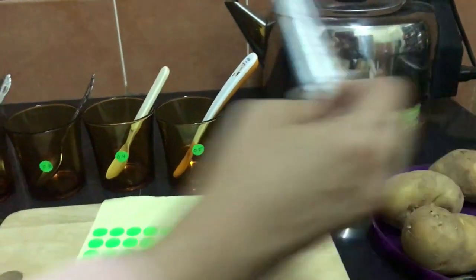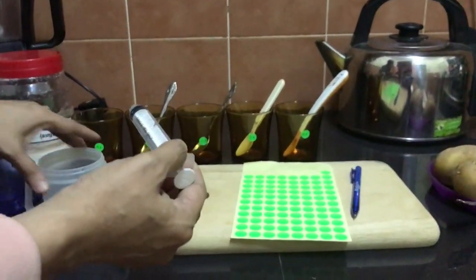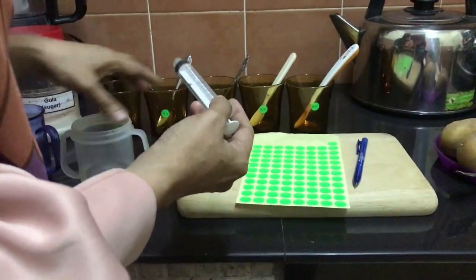Now you need to use a syringe to prepare the different types of sucrose solution.